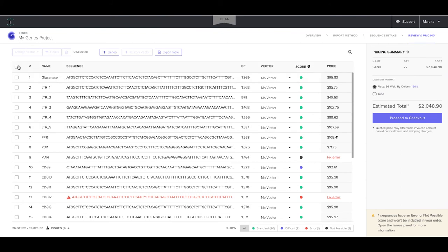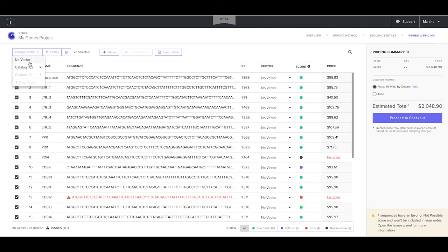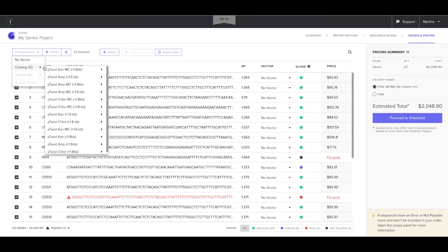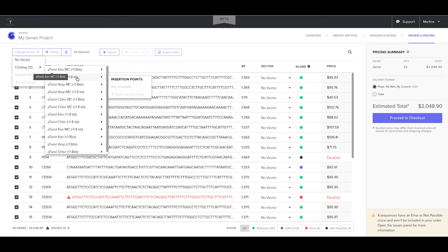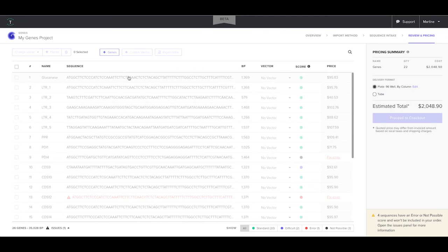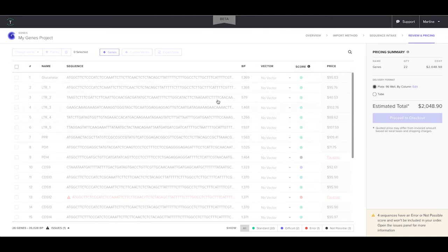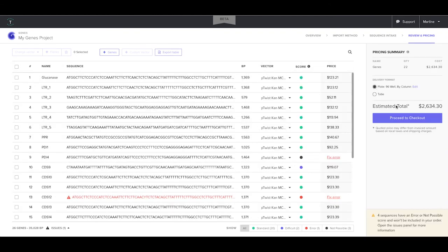To order clonal genes, first select the genes and then choose either a Twist catalogue vector or a previously onboarded custom vector. Twist catalogue vectors are for constructs of either up to 1.8 kb or between 1.8 kb to 3.2 kb. In this instance, all my sequences are less than 1.8 kb, so I will select this vector and my sequences will be automatically re-scored and the price will also be updated.